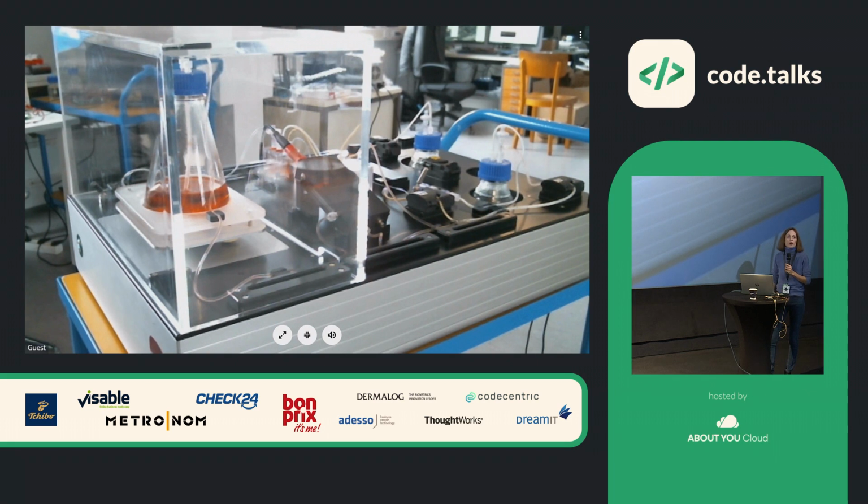Let's assume that you want to hook up a sensor that is not in the machine. We are using C++, so you write the code to read your sensor, and then in a configuration file you tell the machine, and say to the UI, there is this extra module called this and that, and you send a description saying what it can do. Then the UI automatically knows that there is a new module or new sensor, and the UI doesn't have to do anything. So it's totally handled on the microcontroller or Raspberry Pi side, depending.